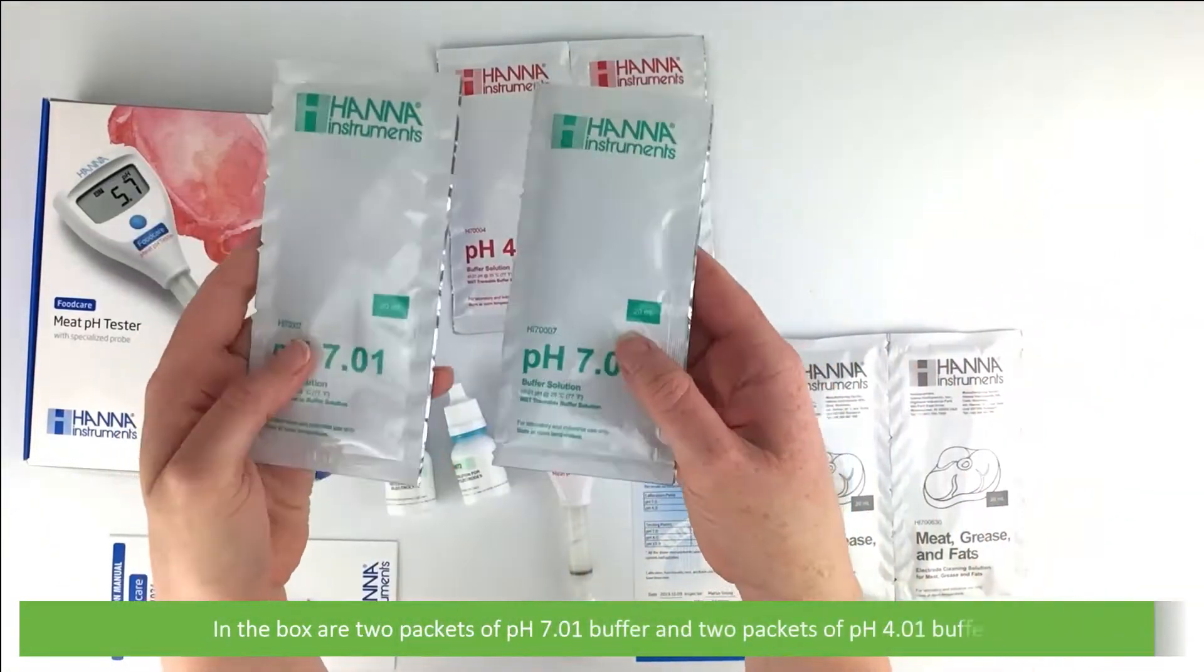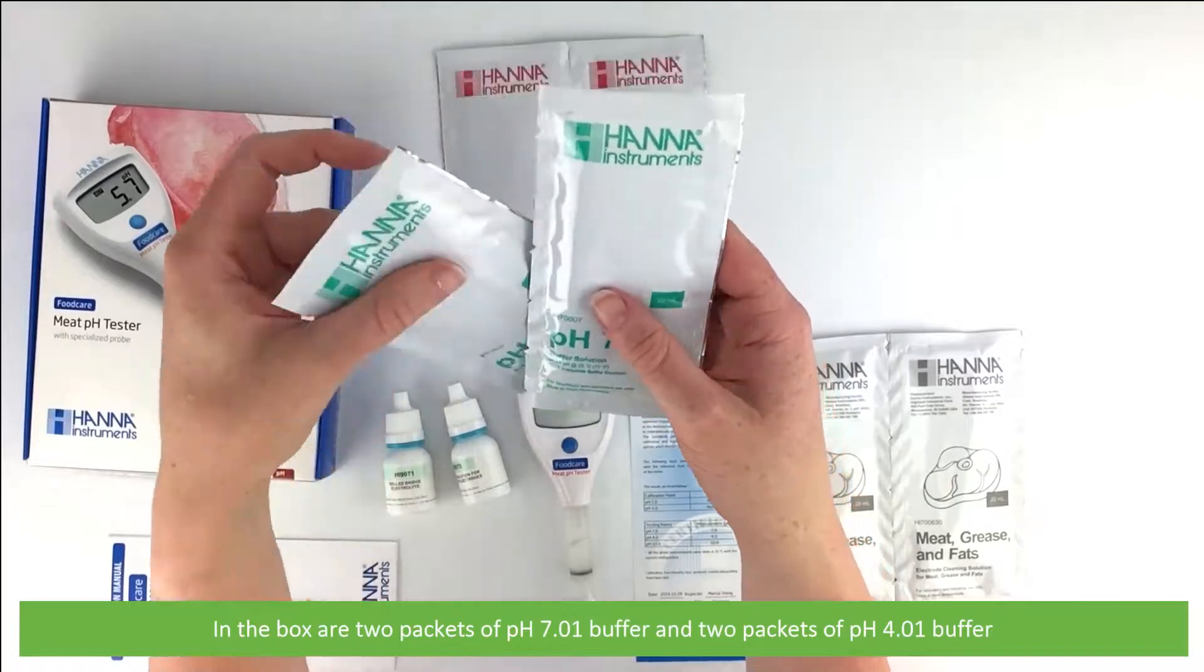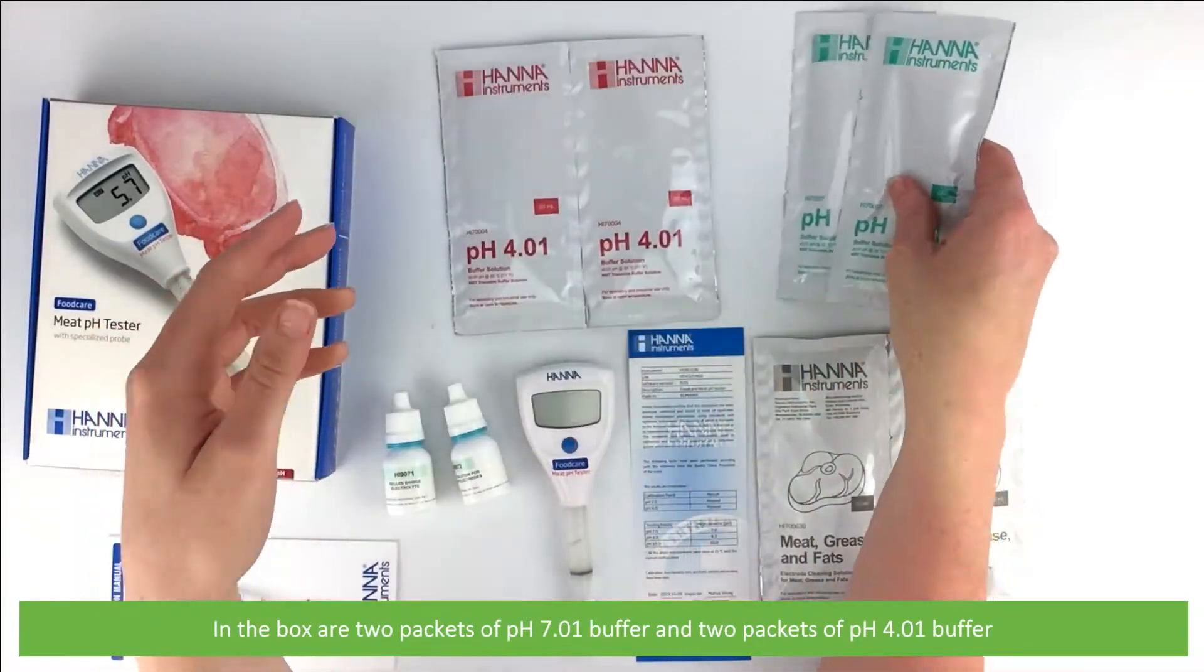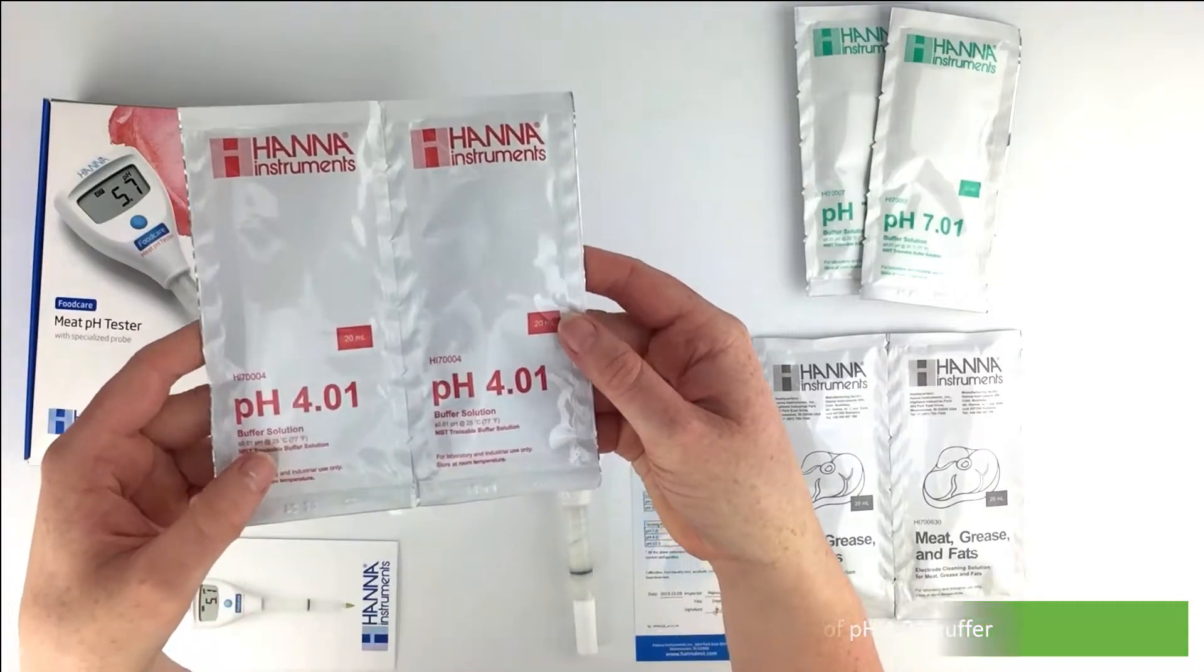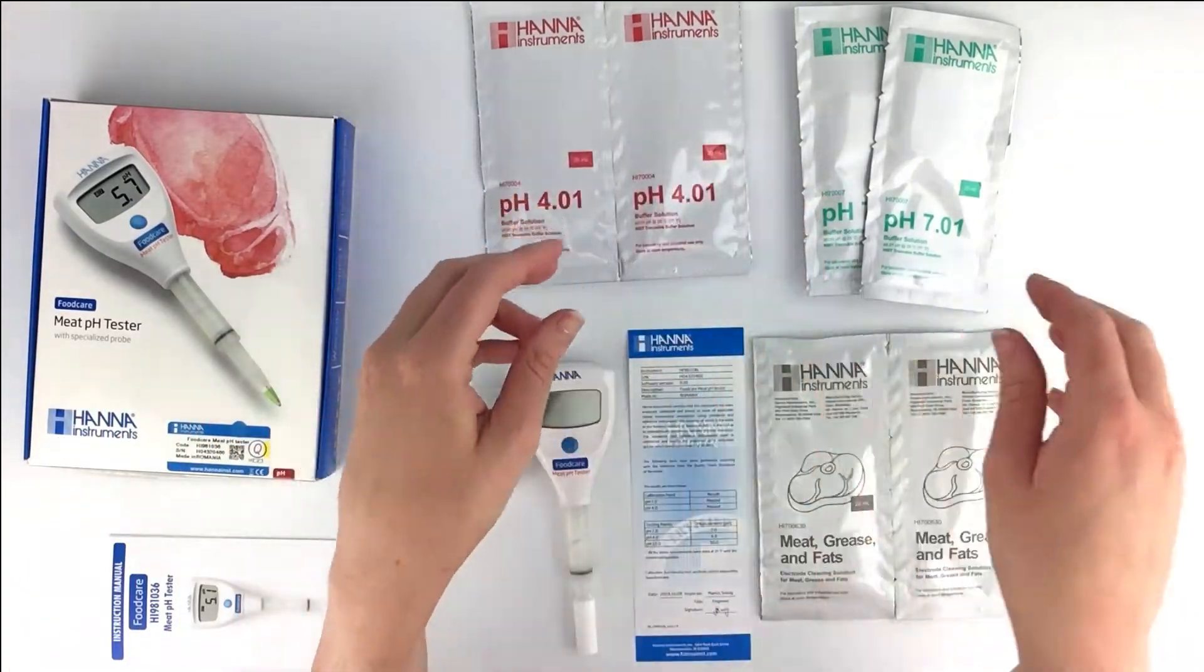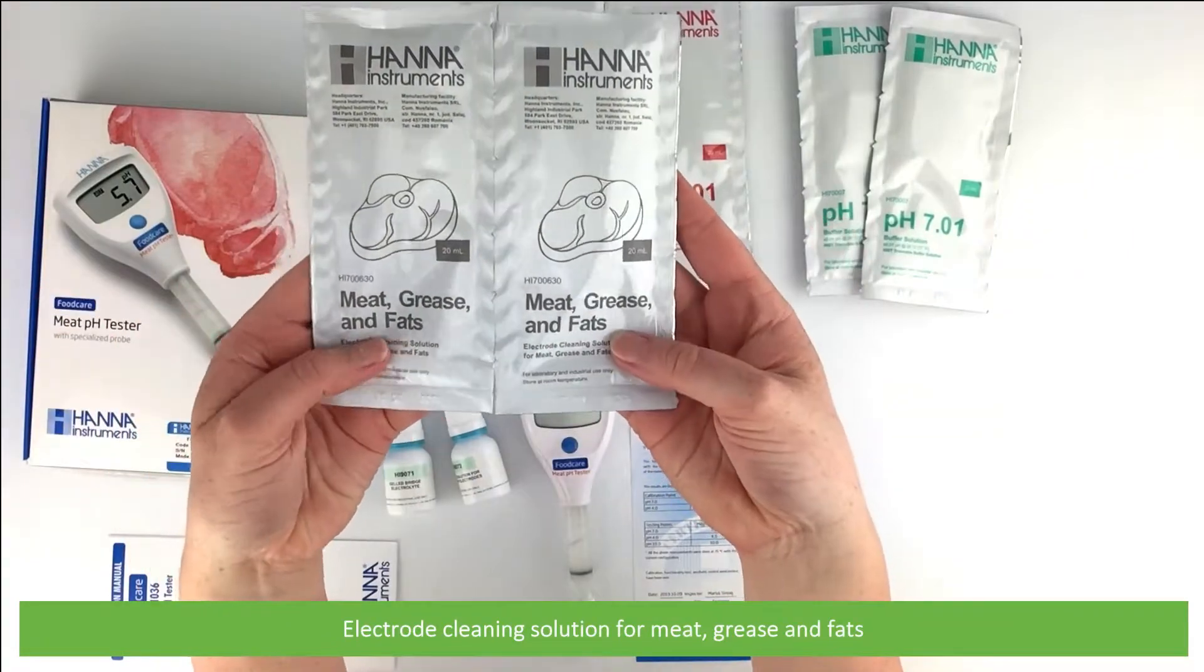In the box are two packets of pH 7.01 buffer and two packets of 4.01 buffer, electrode cleaning solution for meat, grease and fats.